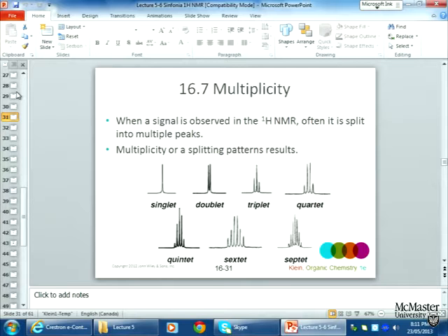We start with information like mass spectrometry, which tells us the molecular weight. Carbon NMR tells us the number of carbons that we might have in the molecule. Proton NMR, the number of hydrogens. And we can work our way towards a molecular formula. So molecular formula is more specific than molecular weight, and we've got some degree towards solving the structure. And we can begin to work out whether we have some functional groups, and so forth, from infrared. But we really need a way to put all the pieces together.